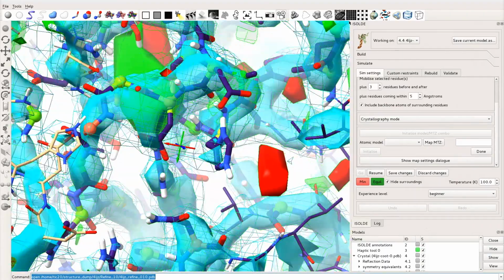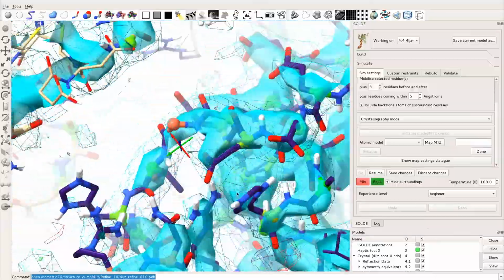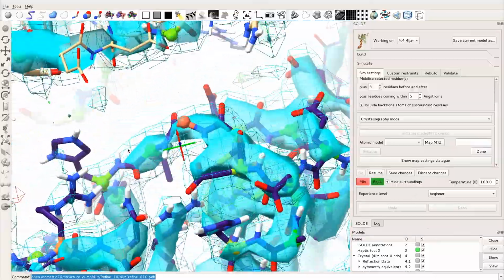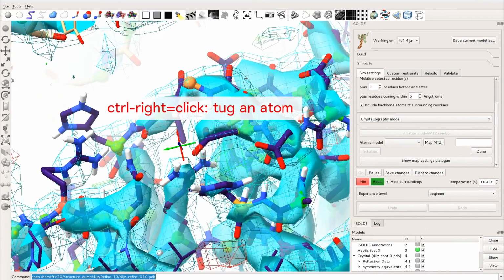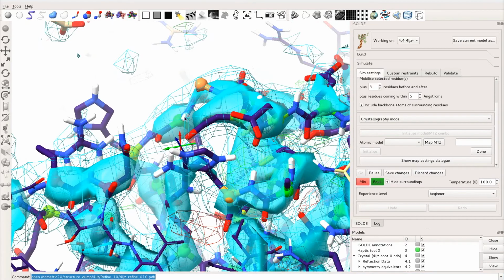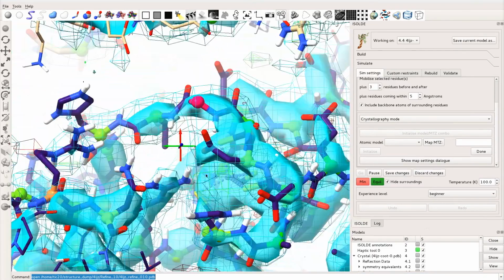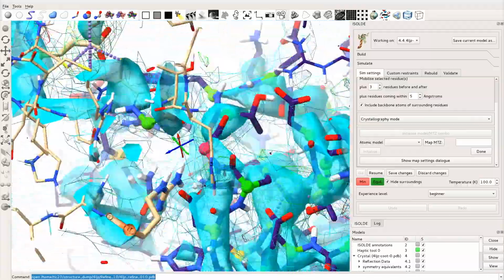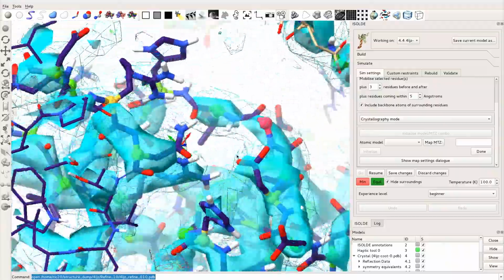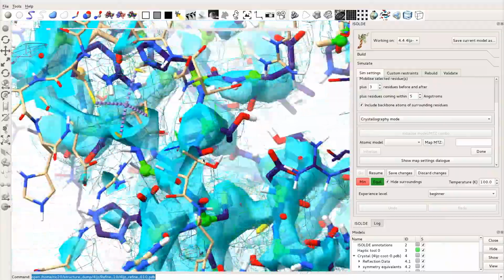The meaning of my statement about the model acting like a real molecule should now become clear. The major advantage of working in the context of molecular dynamics simulations is that impossible, or even highly improbable, conformations are simply disallowed by the environment. When you tug on an atom, it and all its mobile atoms react and adjust according to both bonded and non-bonded interactions. Clashes, that is, atomic overlaps, are fundamentally impossible, and electrostatically unfavorable interactions will push themselves apart.